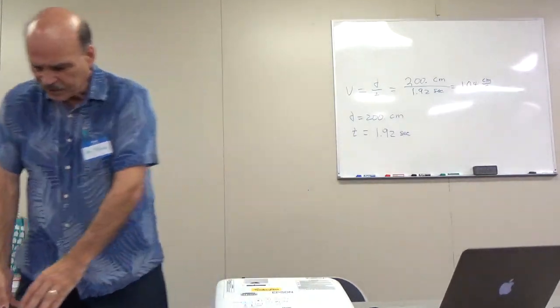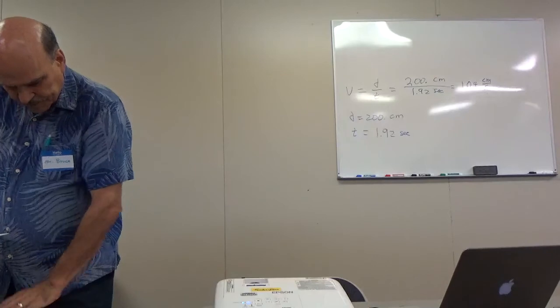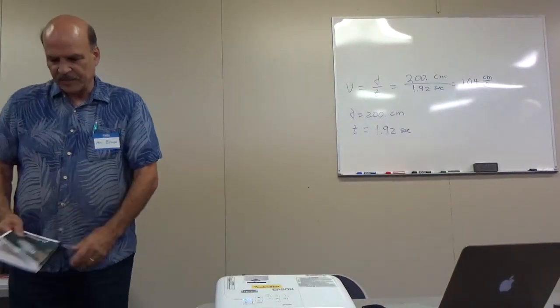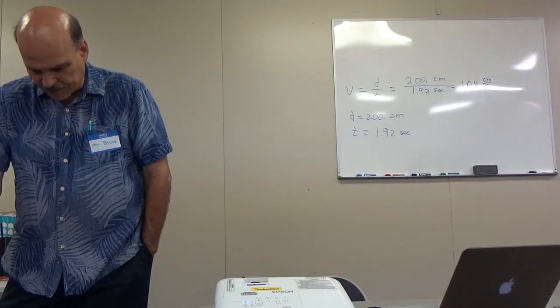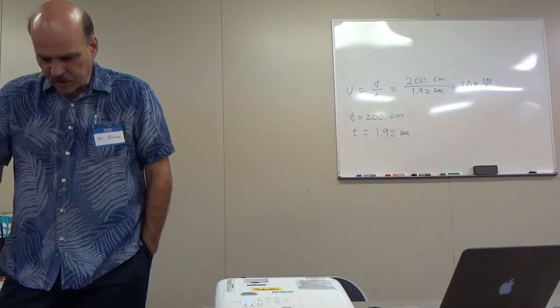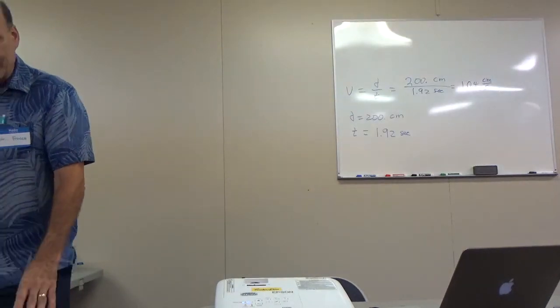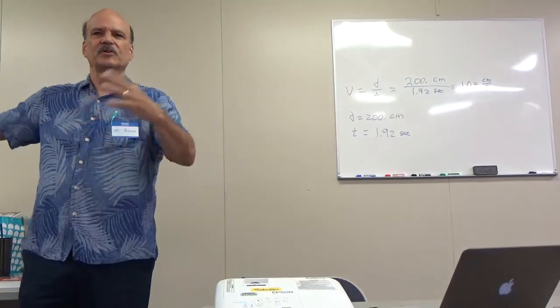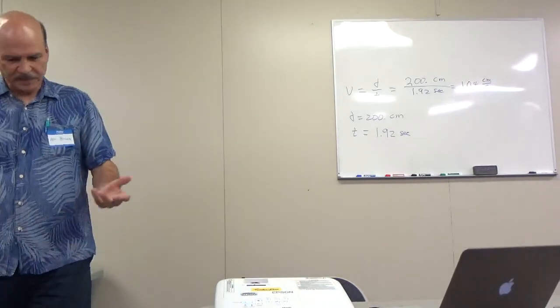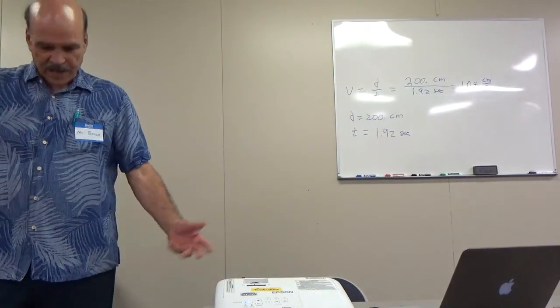That's how that works. But if you look at this, we're going to basically do the lab now. Next week we're going to be doing lab 3, prepare the slide using a wet mount, and lab 4, microscope drawing. You'd have to email me, by the way, that's what they require for this lab report. Email me by midnight, Monday night, your lab write-up for the lab you're going to do today, which is mainly just observing and explaining it. Not a real lab as far as doing experiments to see what happens.